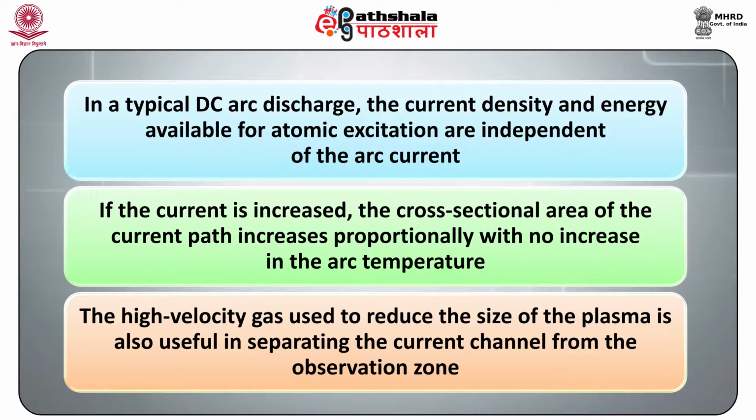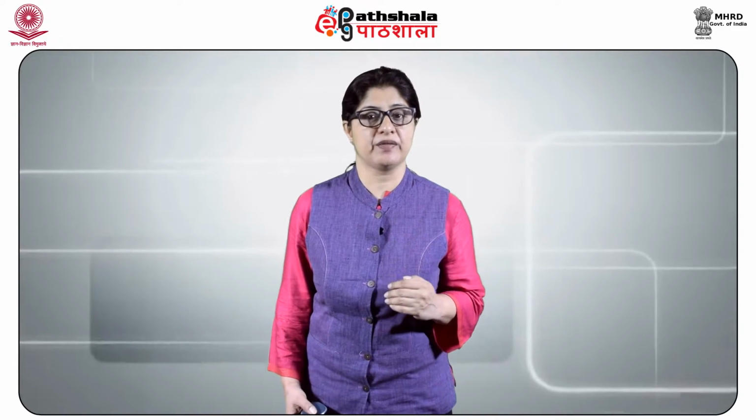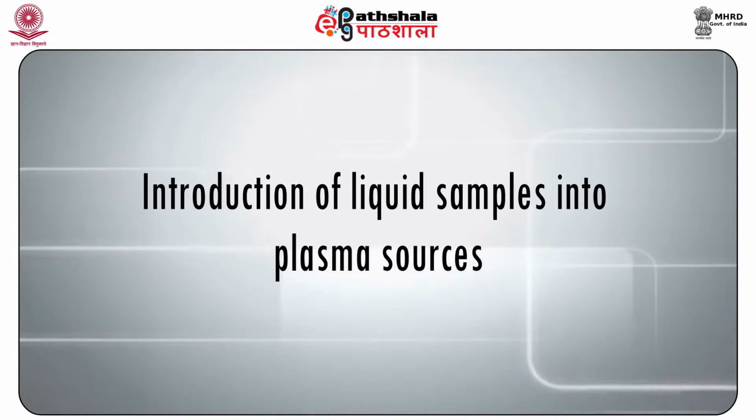If the current is increased, the cross-sectional area of the current path increases proportionally, but with no increase in the arc temperature. The high velocity gas used to reduce the size of the plasma is also useful in separating the current channel from the observation zone. A direct current plasma requires about 1 kilowatt of power and consumes about 8 liters per minute of welder's grade argon.